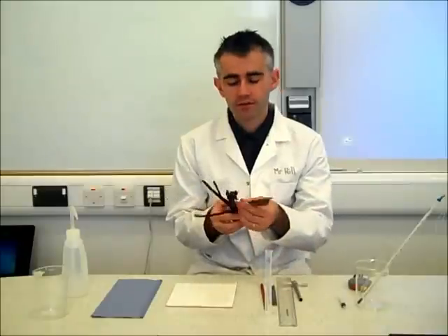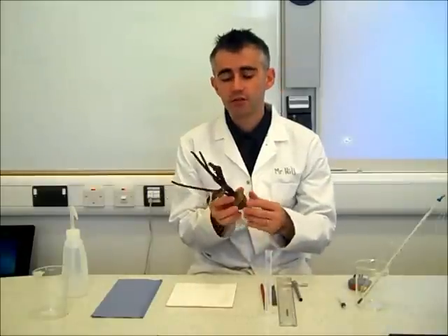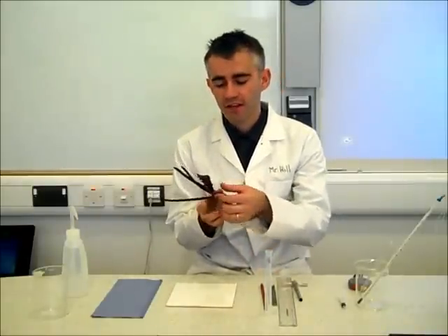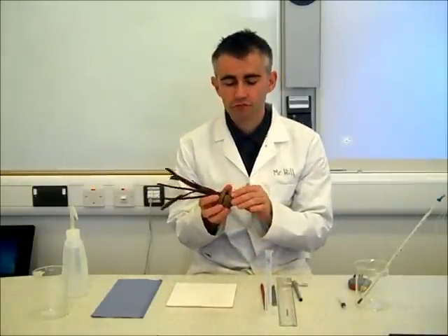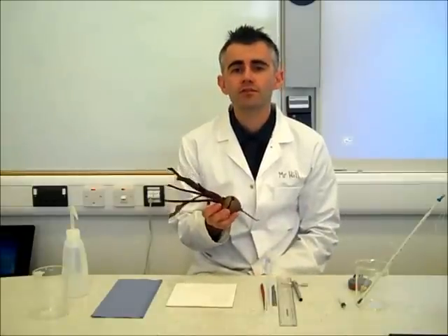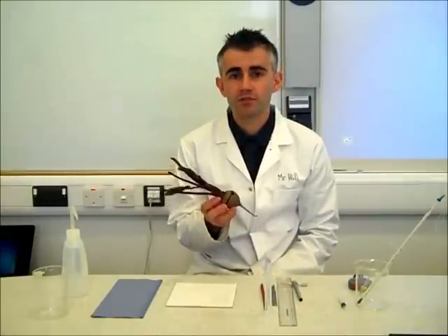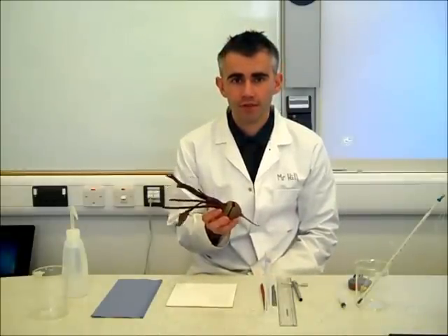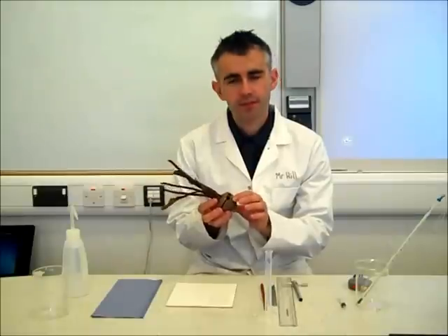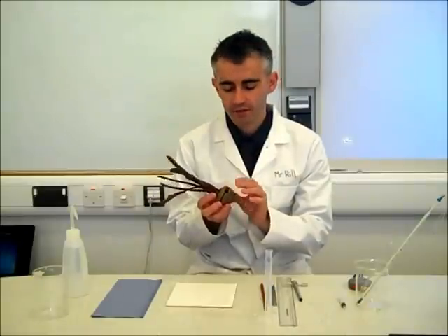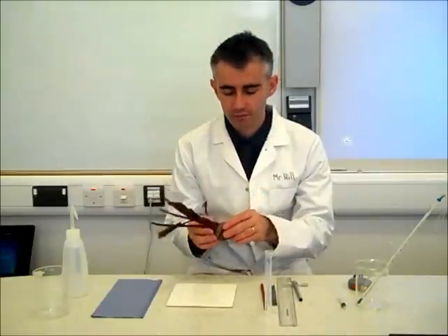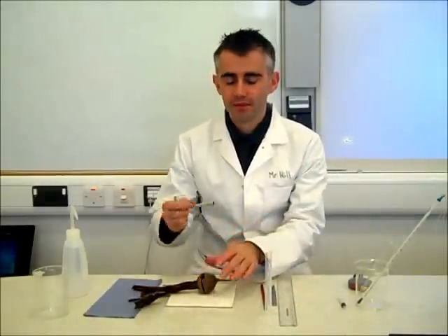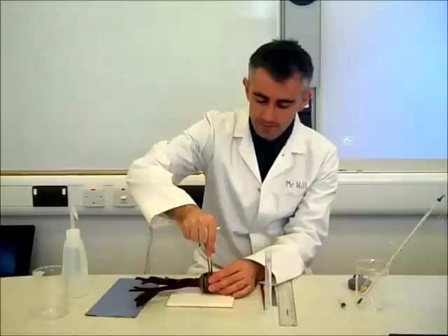There are also different tissues within a variety of beetroot: leaf tissue, stem tissue, and root tissue. It's very important that you use the same source of tissue for your investigation. We're going to use part of the root of the beetroot, and I'm going to take a sample of that using a corer.